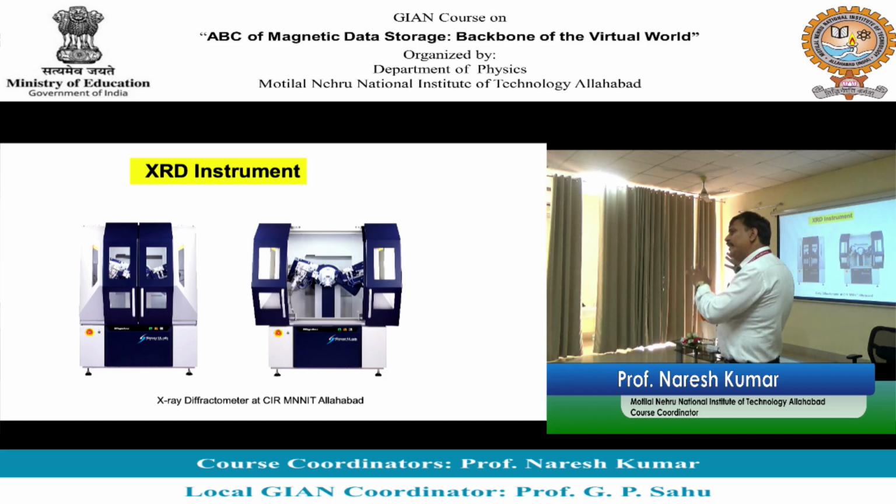So with any experiment that you are dealing with, please look at its safety aspects. देखिए रिसर्च तो बहुत सेकेंडरी है, your life is very important, है ना, very, very important. सो कभी भी एक्सपेरिमेंट हमें तो आपको बताएं कि जब हम कुछ एक्सपेरिमेंट करते थे, my boss used to sit, कि जब तक एक्सपेरिमेंट करेंगे I will be sitting with you. अकेले एक्सपेरिमेंट मत कीजिए, दो रहिए, है ना, एक को बिठा के रखिए, चाय पिला देना उसको, पास वही बैठा रहे. In case of emergency he can help you out.